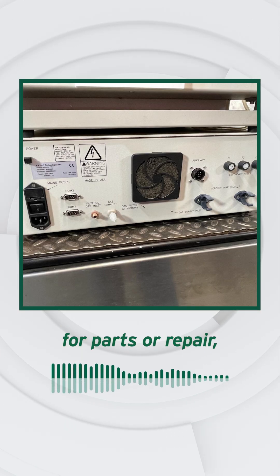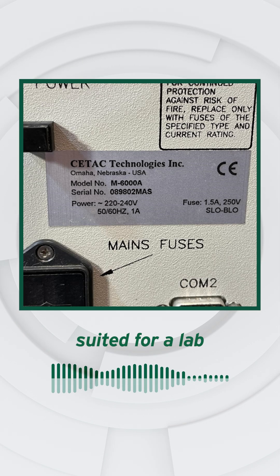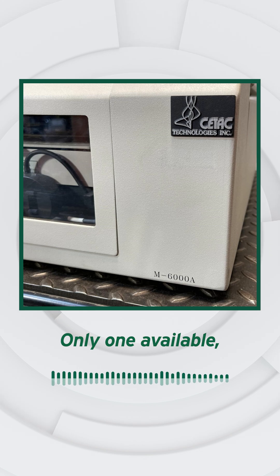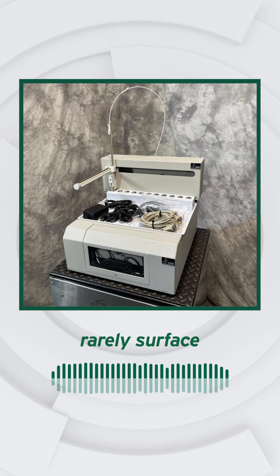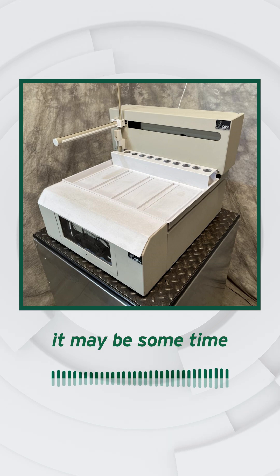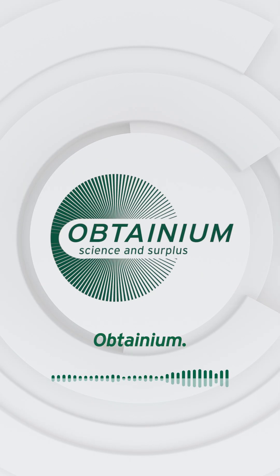Offered as-is for parts or repair. Suited for a lab or technician with the tools to restore it. Only one available, and systems like this rarely surface in surplus. Once it's gone, it may be some time before another turns up. Obtainium.